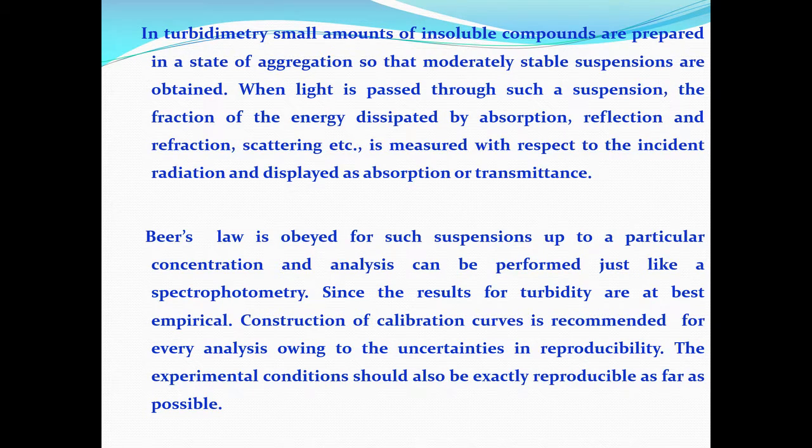Every time you want to do a turbidimetric determination, we recommend that you prepare your calibration curve on the same day, at the same time. Whenever you make your unknown measurement, the standard should be prepared and mixed along with the sample under similar conditions, and that data will hold good only for that set of samples and calibrated standards as far as turbidimetry is concerned.